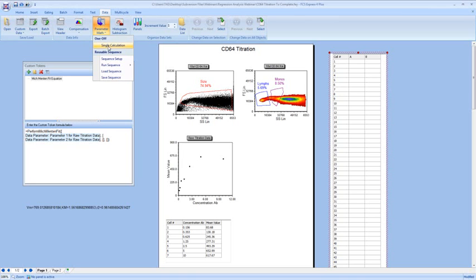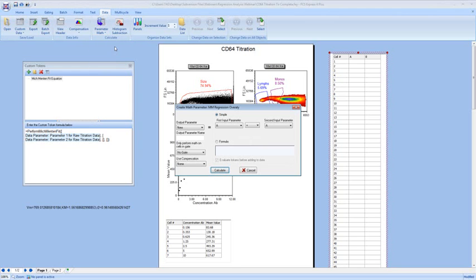So I'm going to do a single calculation with my parameter math, and you can see that my custom data is selected. And we want to use the A parameter for this. And the formula that we want to use is equals, and we're going to use 1 divided by 10, because that's the value for 0.1, right? And that's going to be our starting point. And we're going to add this to row minus 1.